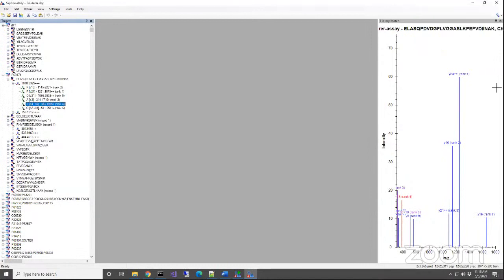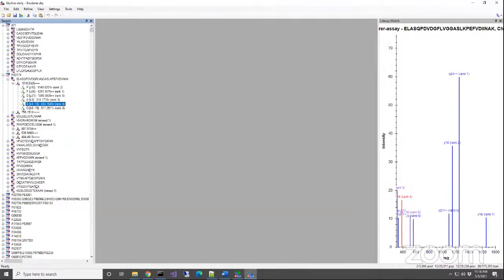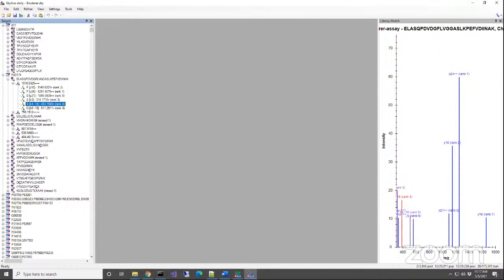All right, so Orbitrap, QE HF-X. Okay, great. So thanks for all those answers everybody gave me. So yeah, it's basically a QE HF-X sort of, but so was the Lumos.